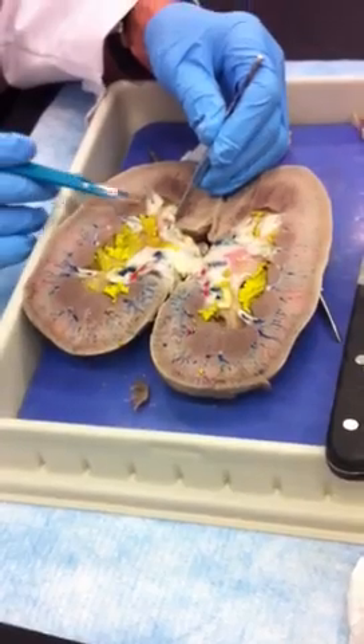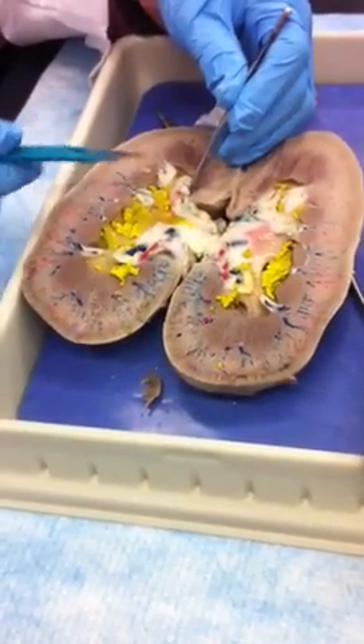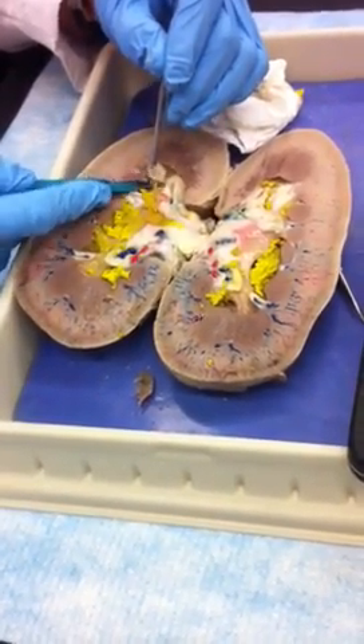Look at that minor calyx right there. There's a pyramid right there with the — there's a column sticking in the way, but I'll just have to get it out of the way.